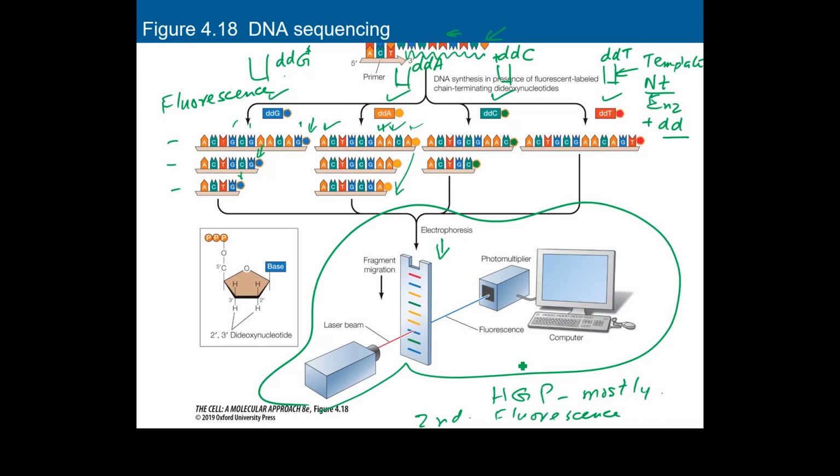Actually, I was at Cold Spring Harbor when this technique started to be used in DNA sequencing. Our lab at Cold Spring Harbor was into sequencing, so that was my first introduction to DNA sequencing. We did lots of sequencing of many different types of organisms, including humans, Arabidopsis, yeast, and some other things as well. We used to start the gels at night and they would be done in the morning, or start the gels in the morning and they'd be done in the afternoon. So that was my life for a couple of years as a postdoc there.